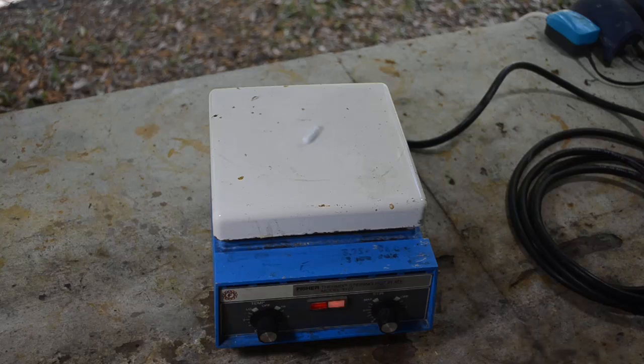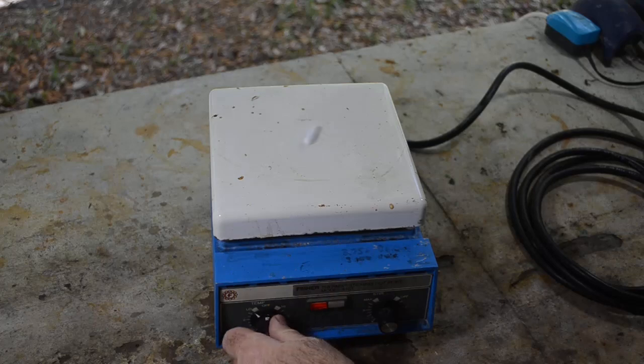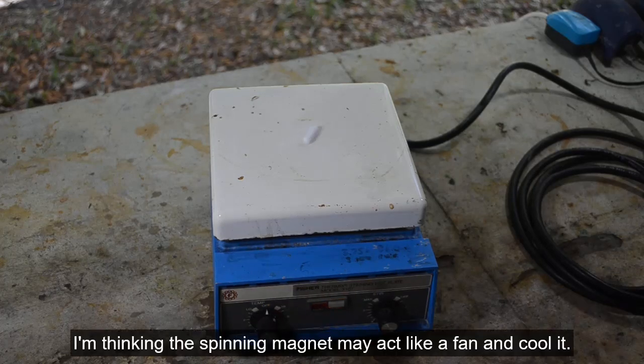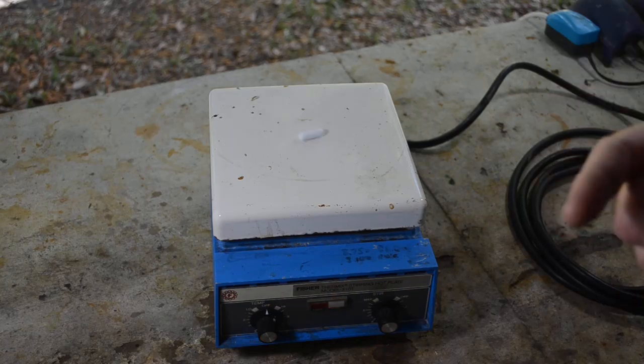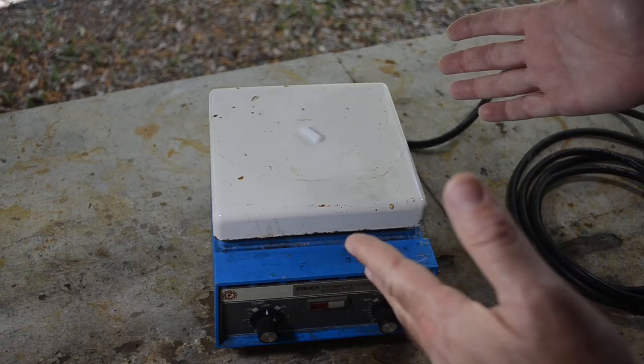I could have got one of the cheap Amazon ones, but I'm hoping this one will hold up better even though it's used. I'm going to turn it off and let it start cooling down so I can handle it. I'll leave it spinning — maybe the spinning magnet inside will help cool it down a little bit. Let me cool it down so I can handle it, and I'll have to find a home for it in the fume hood. I'll take out one of my crappy cheap hot plates in there and make room for this thing. I'll hold the other hot plate in reserve. Yeah, we'll get this thing in the fume hood and do its inaugural extraction or whatever pretty soon. It'll probably be in another video. That's great, and I hope some of you out there who have been telling me I need to do this for a long time will be happy — okay, I got one.